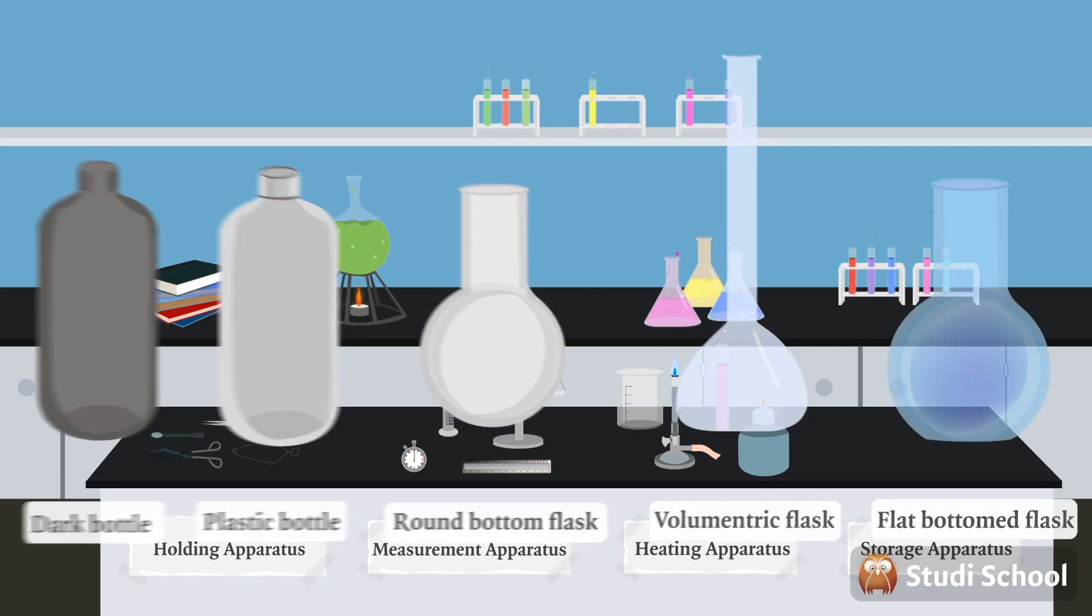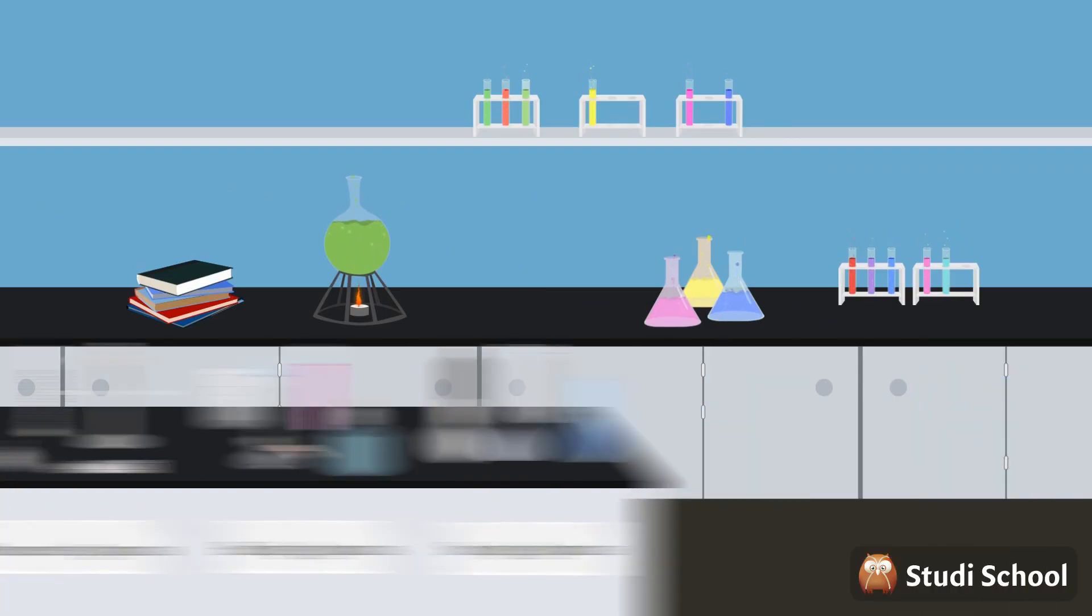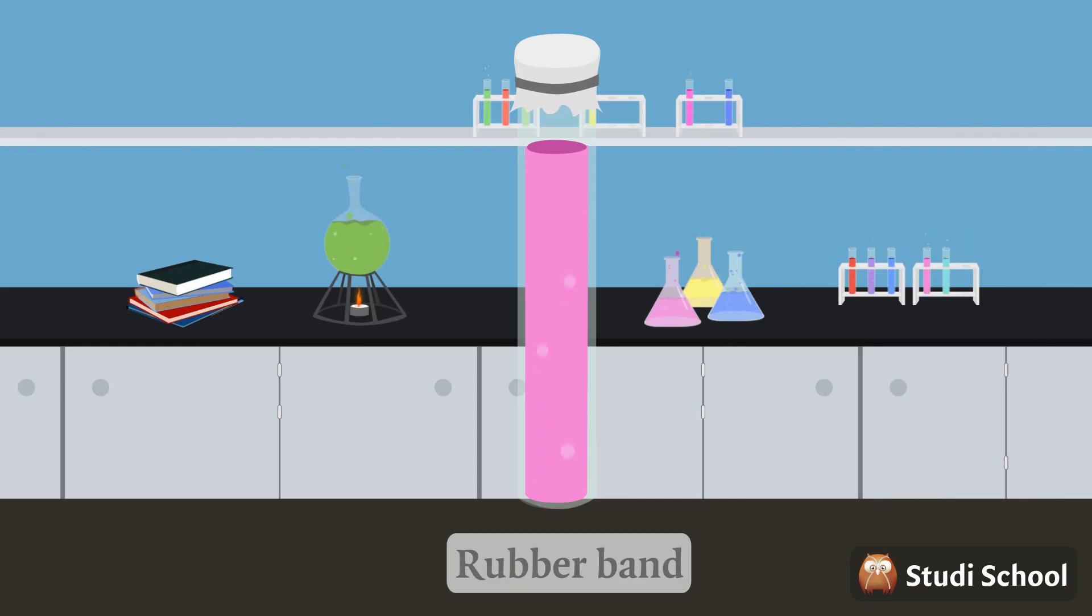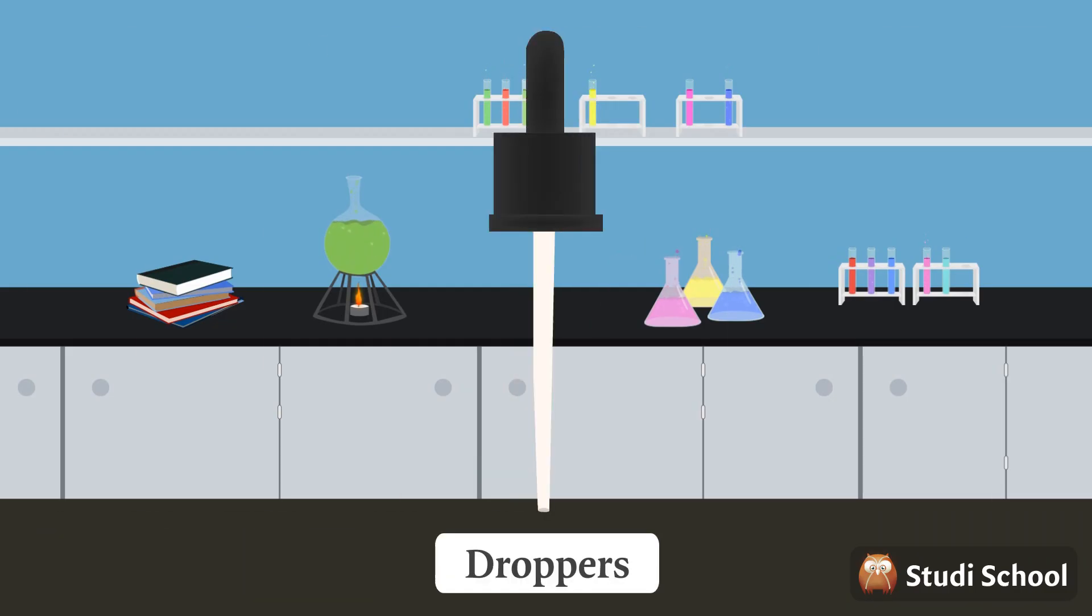Let's look at some apparatus in more detail. This is called a desiccator and is used for drying specimens. These are rubber bands to prevent gases or liquids from escaping out during experiments. These are called droppers and are used to transfer liquids drop by drop.